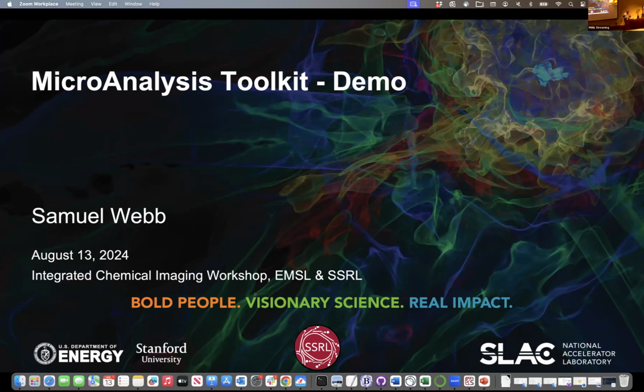So this is going to be a live demo, so it's going to be very fluid in what we talk about. If you have questions, scream out or chat online. I have a few things I plan on doing-ish, but we'll go with the flow of whatever people are most interested in seeing how to do as well. So again, we're very hands-on, very fluid, and we'll try to address the questions that everyone has.